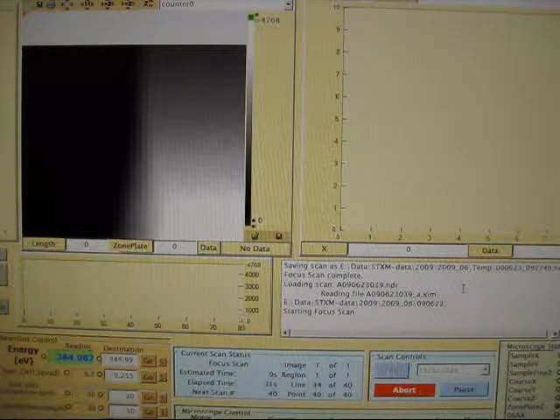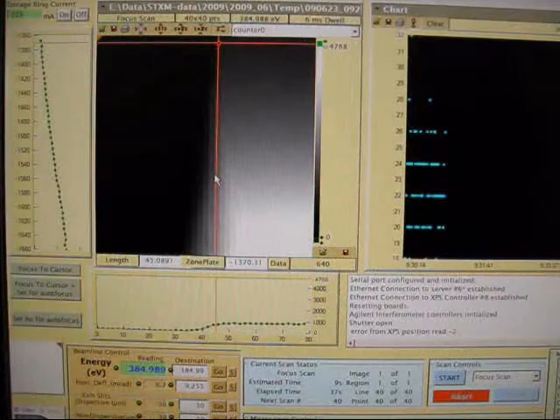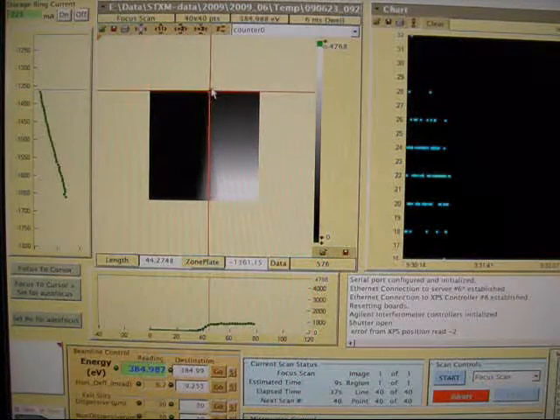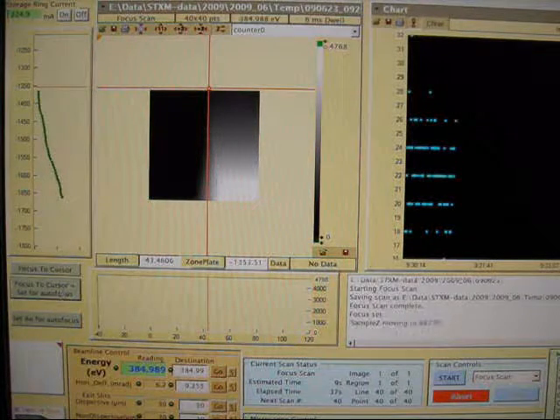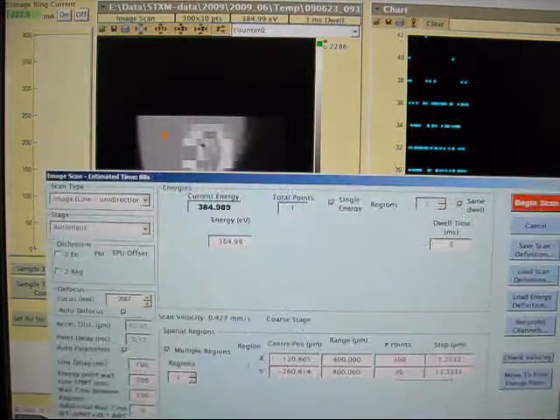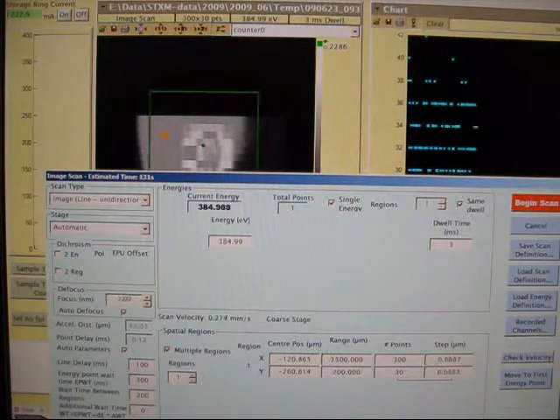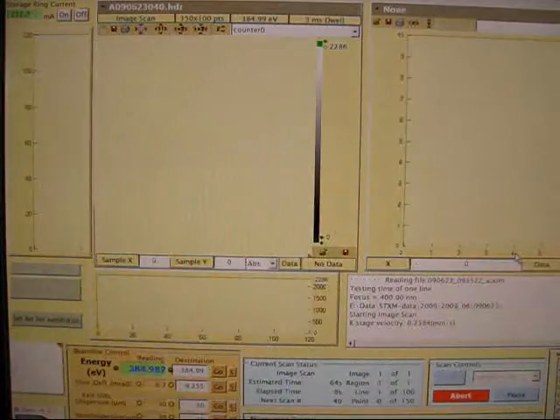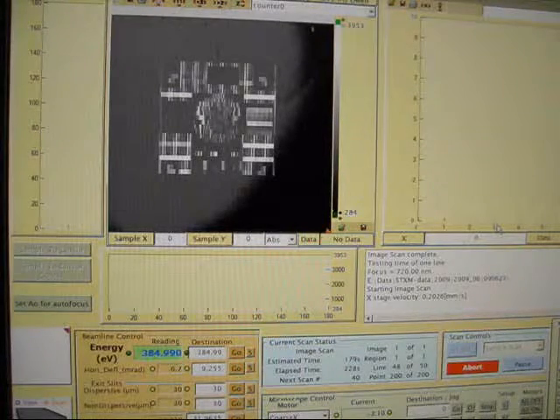In this example, it is still a little bit higher, so we do not save the file, shrink the image, and then click a little bit higher. Then click focus to cursor and focus to cursor plus set for autofocus. Now we can open a previous image and reduce the scan range. And then we should be able to get a clear image.